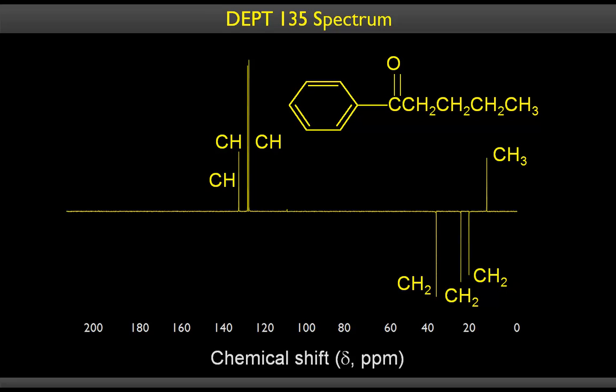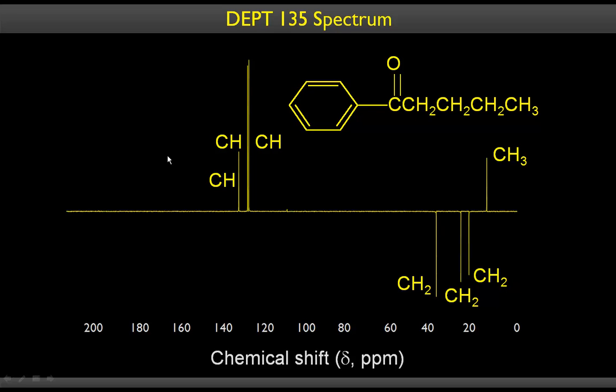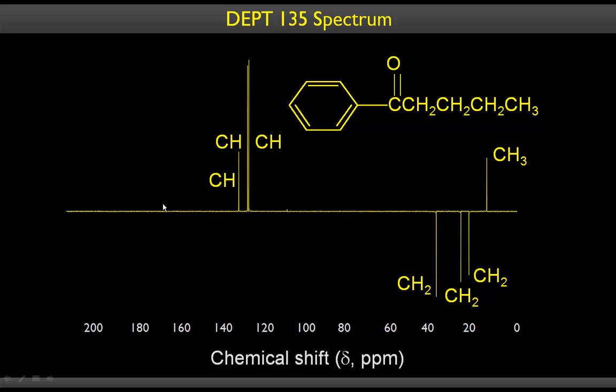If you run the DEPT of that, something is gone, right? We had a carbonyl peak around 200, but that is missing here. So what is missing is the carbonyl. There is no doubt about that. That is the carbonyl peak, so we can assign. And there was some other peak here from this carbon. That's also gone missing. So you can go backward and see that it is missing. The quaternary carbons do not show up in DEPT 135. Okay. Methynes and methyls show as positive peaks. So we have one methyl and two or three methynes, because 1, 2, 3, and that's seen here.